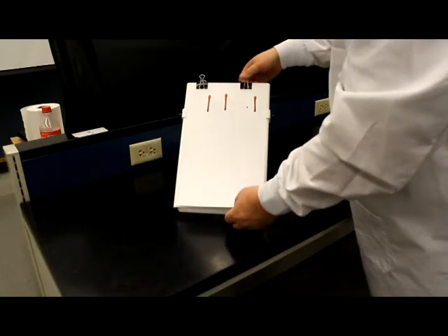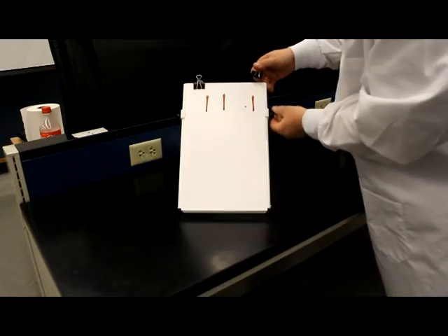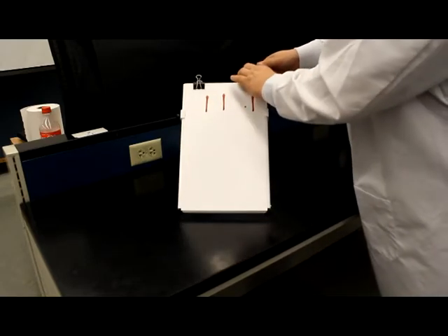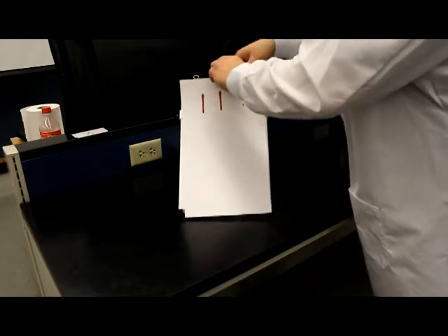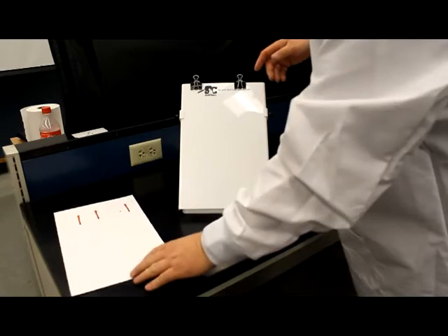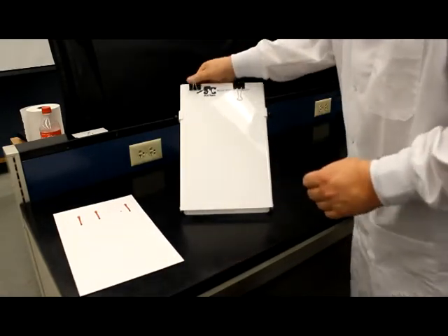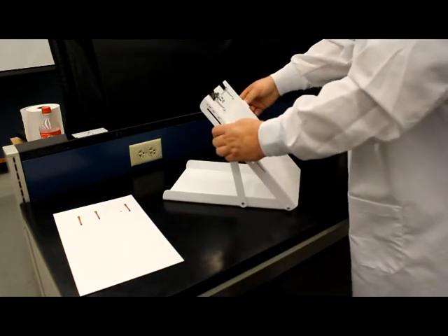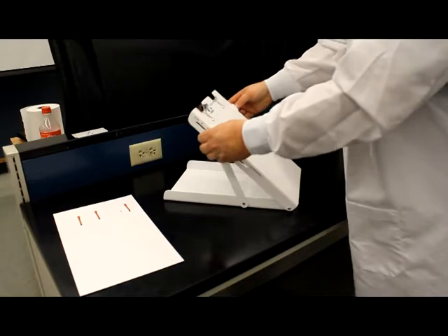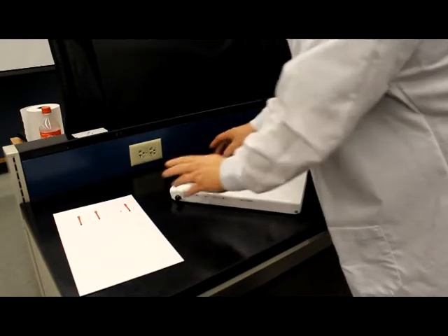When you're done, you're going to want to go ahead and remove the paper from your binder clips. Like so. This is going to then sit and dry. And because you're finished with this apparatus, you're going to want to put it back in the condition that you found it. You're going to want to go ahead and loosen these up again. Again, don't force it. And you're going to want to lay it down and then tighten them back up.